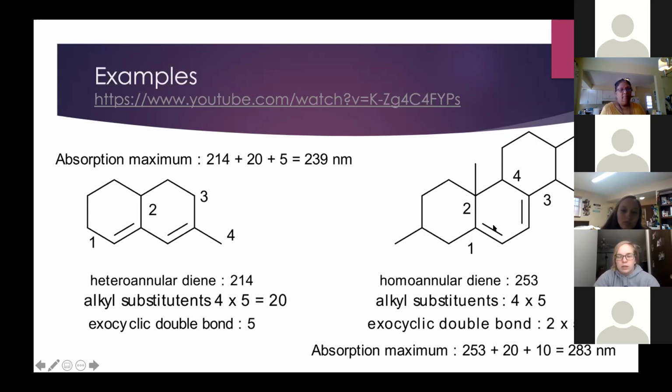And then the same thing over here, because you have your double bonds within this same ring. So you're going to be looking at this carbon, this one here, and then this one here. And all the others don't matter because they're not directly connected to the pi system.